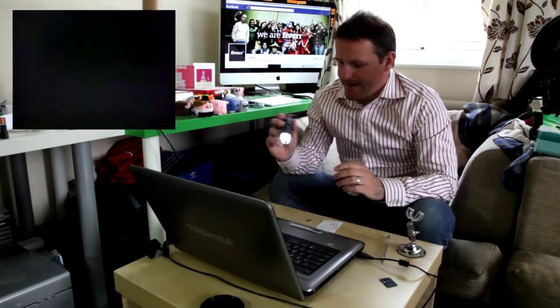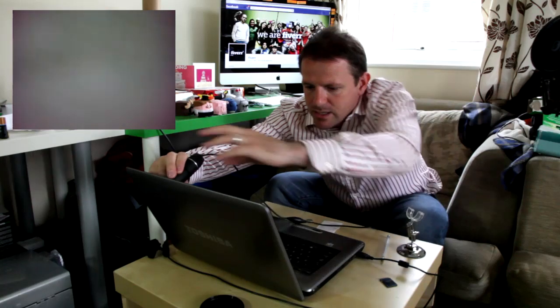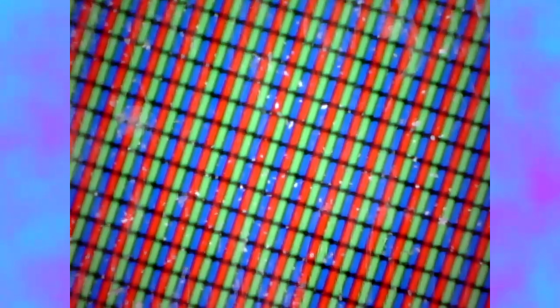Now the computer screen — it's really cool. If I focus on it, it shows the individual pixels. Let's get it right there — that's just a white screen. So white is made up of black, green, red and blue, RGB. I think that's fantastic how it does that. You can see how dirty the screen is, although it doesn't look dirty to me.